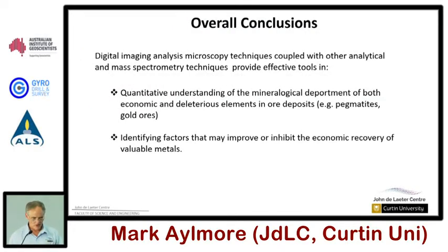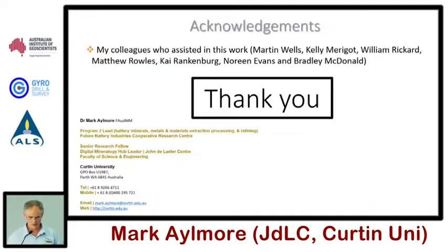So, overall conclusion: digital image analysis microscopy techniques coupled with analytical mass spectrometry techniques are a very effective tool for quantifying and understanding mineralogy and identifying factors that can improve it. So encompassing all our facilities at the John de Laeter Centre, we can get a pretty good picture of some of these things. Thank you.